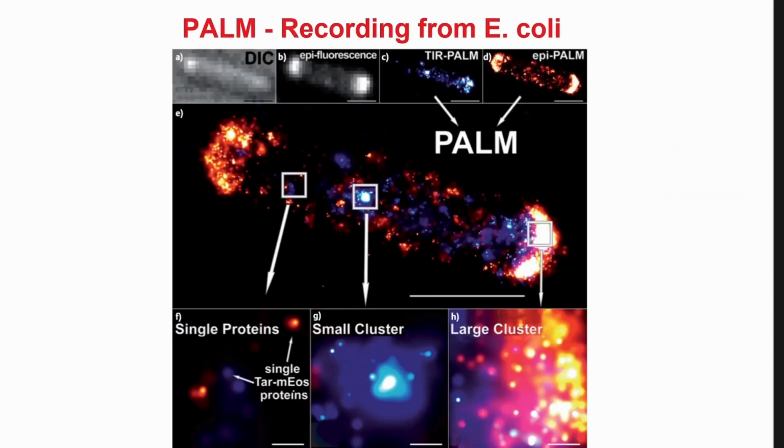And then you end up with images like that, where the individual molecules are laid out as these spots. Now, if you start to have clusters, because either your chemical structure was wrong or because you illuminated the tissue with too much laser on the way back, you will have clusters which will then drop your resolution because there is not a whole lot you can do with this.